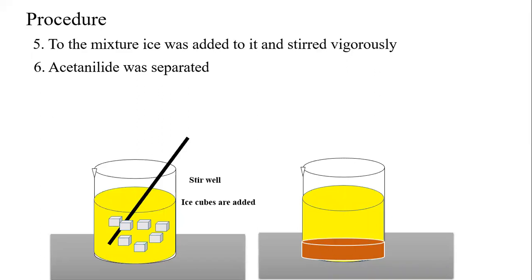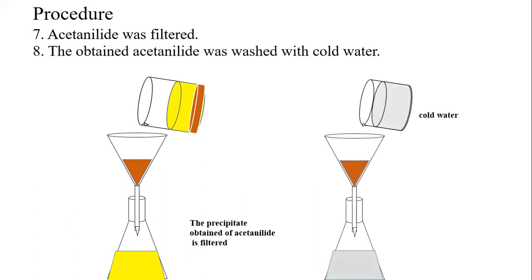What we will do now, it has been settled down, so we need to filter it. We will take a filter and a conical flask and we will put a filter paper along the funnel and we will try to filter the precipitate of acetanilide that has formed.